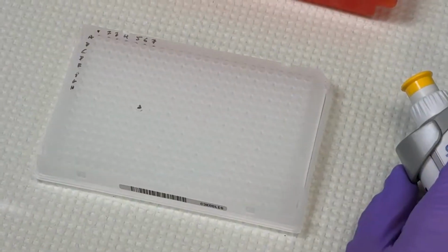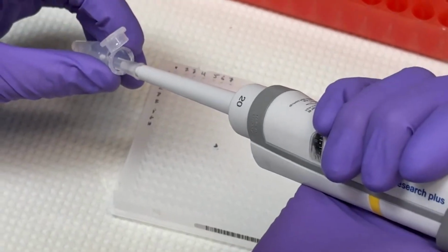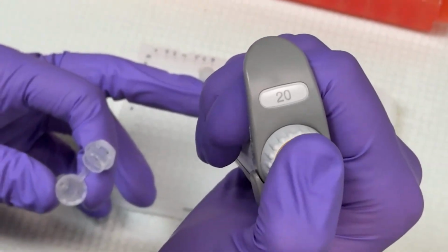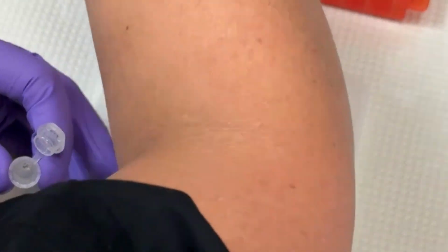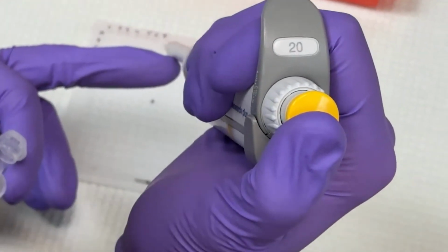18S and TERT are both really common, really good endogenous control tests. We're going to see how they compare against each other.